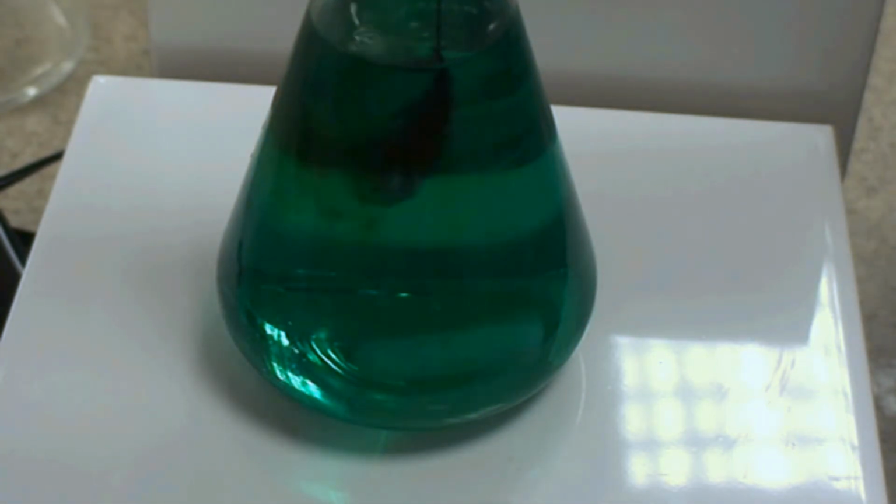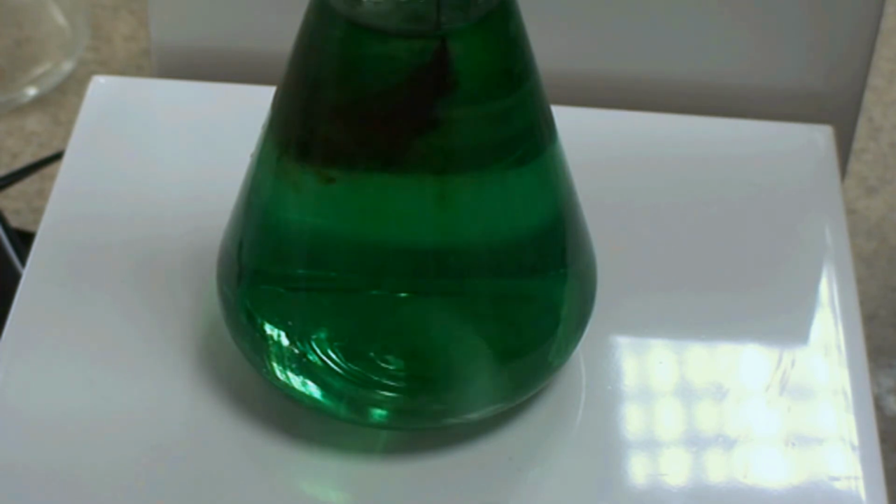It is worth pointing out that you will often see a wider range of colours than this simply due to colour mixing. For instance, the solution was green between the blue 4+ and the yellow 5+, but that is simply because it contained both colours, and yellow plus blue when mixed give green.